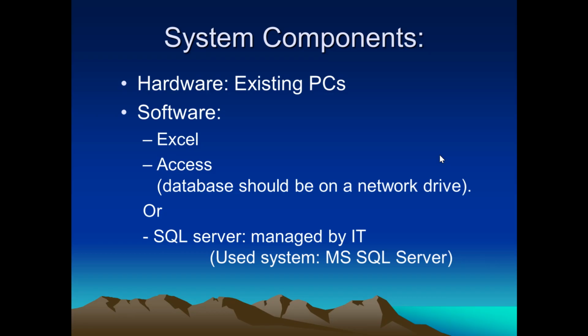The system is actually very simple. Just a common lab PC, and the software, as long as you have Excel installed, and Access too. But for group use, this Access database file should be saved on the network drive so it can be shared by the group.